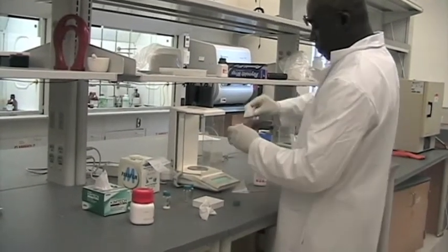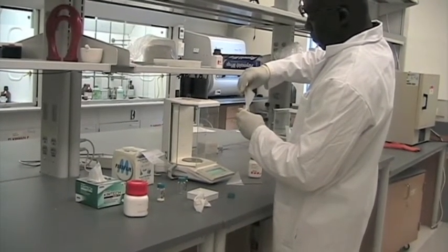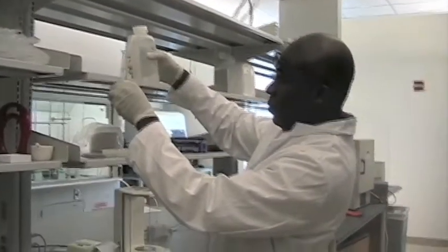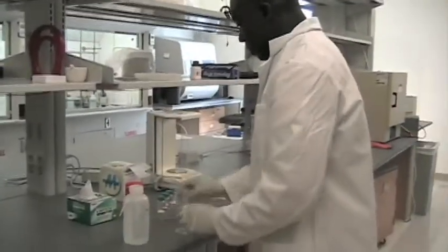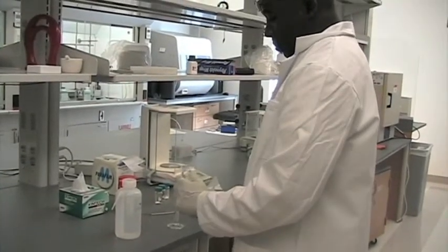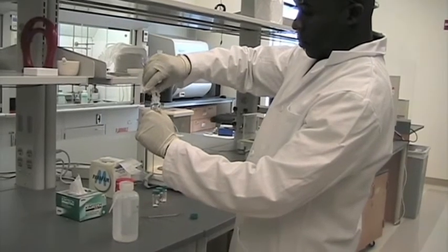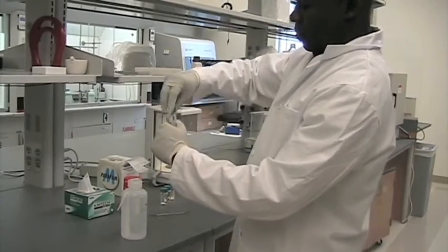It's important to make sure that you don't spill anything in the lab for safety reasons. Now I'm washing the graduated cylinder that I'll be using to measure the deionized water in which I will dissolve my alginate. Alginate is not very soluble in water, so we need to shake it vigorously to dissolve it, or sometimes we might need to use the sonicator to help us dissolve it.